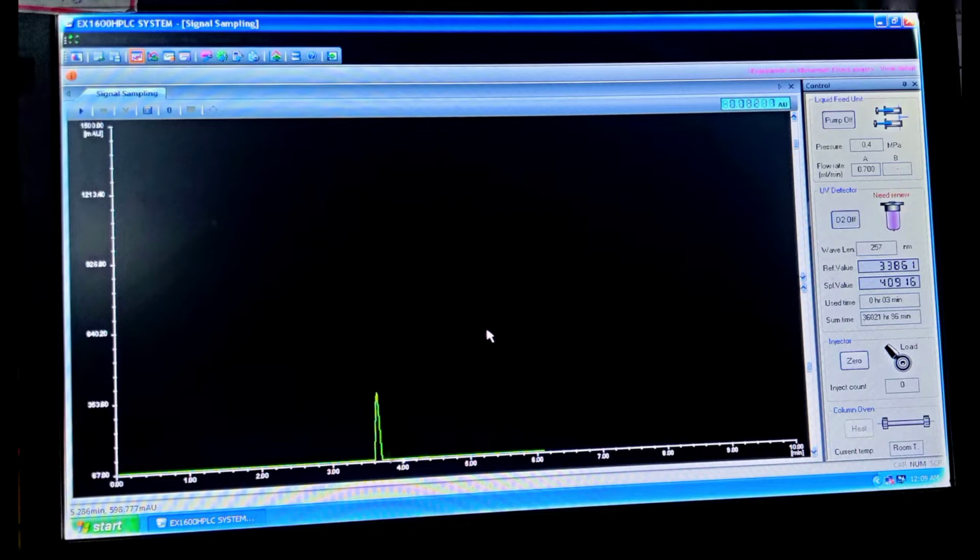In a chromatogram, the x-axis measures the detection time in minutes. The y-axis shows peak area or intensity of absorbance. Retention time is the time between the point of injection and the appearance of the peak maxima. Each component of the analyte has a different retention time value. Peak area is calculated as the area under the curve. The concentration of the sample is obtained by dividing the area of the sample by the area of the standard and multiplying with the concentration of the standard. This gives the proportion of the concentration of the component present in the analyte.